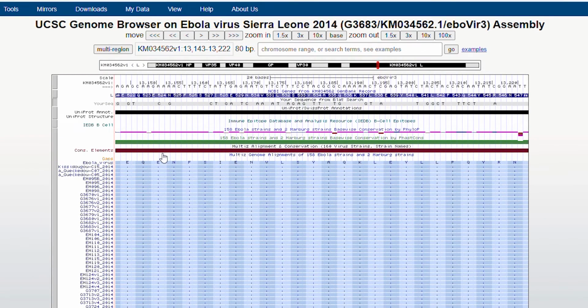Using BLAT, we can see some of the similarities between the Marburg virus and Ebola virus within the L gene, an important part of the virus's functionality as it encodes for the virus's transcriptase, integral to the virus's ability to replicate and survive. This also supports the idea that these areas would be the region most likely to match, since Ebola virus and Marburg virus are in the same family and replicate and spread in the same ways.